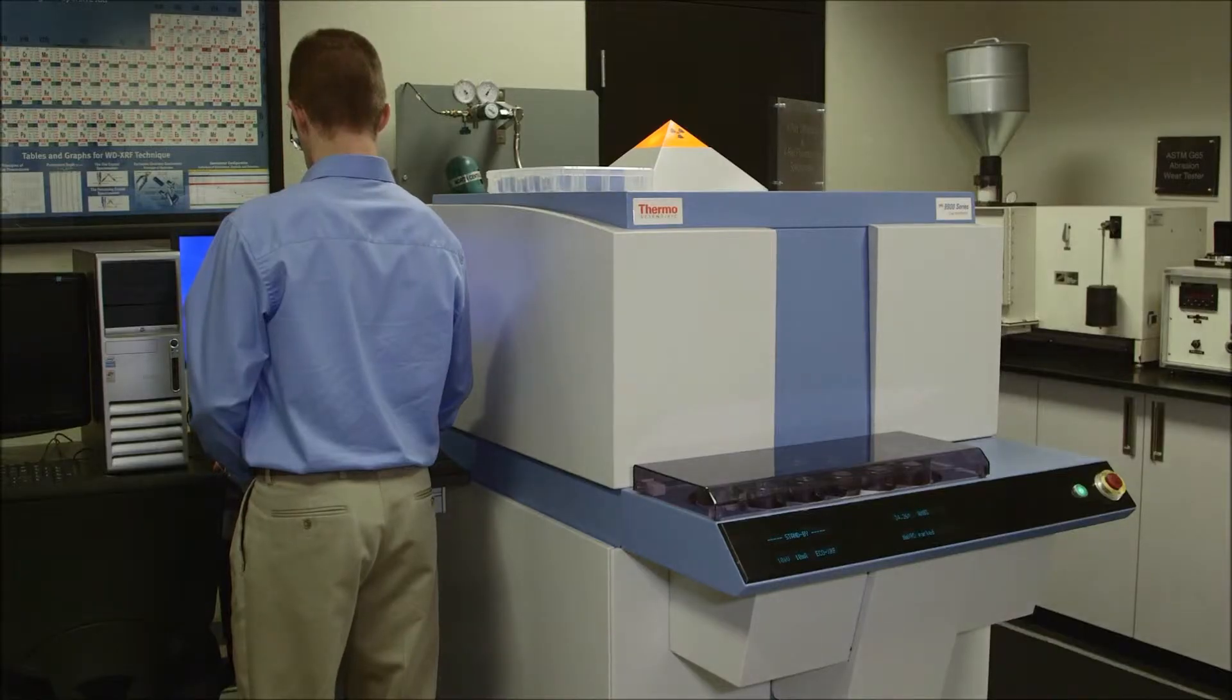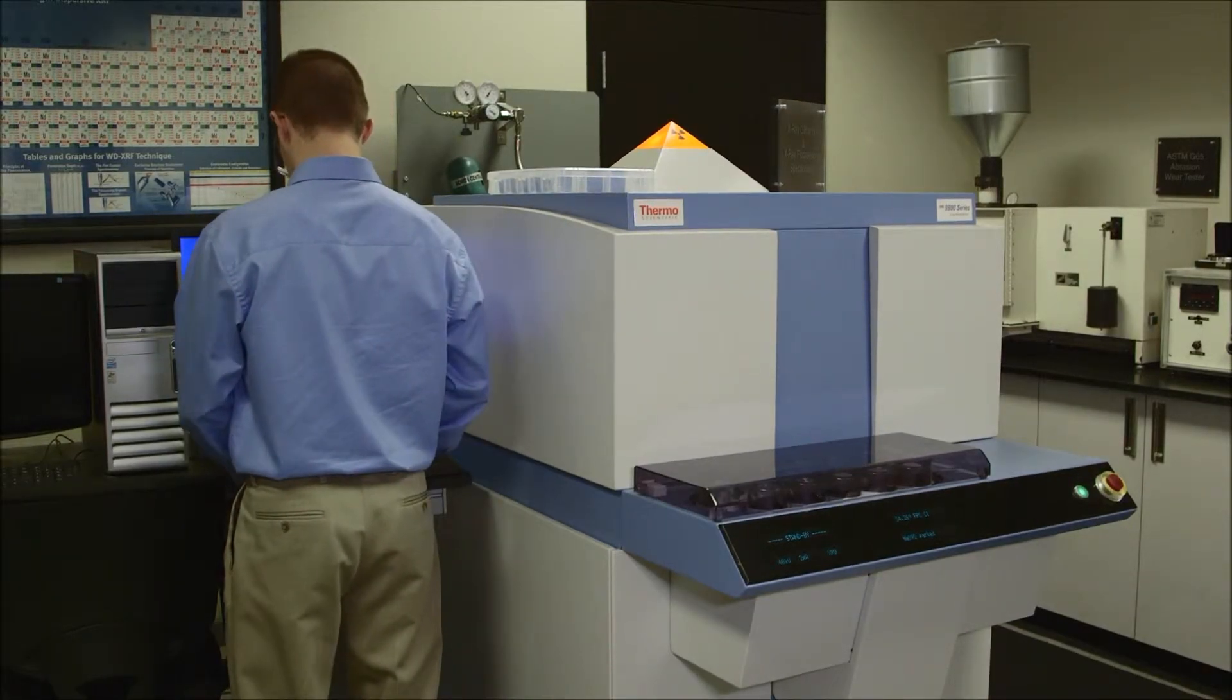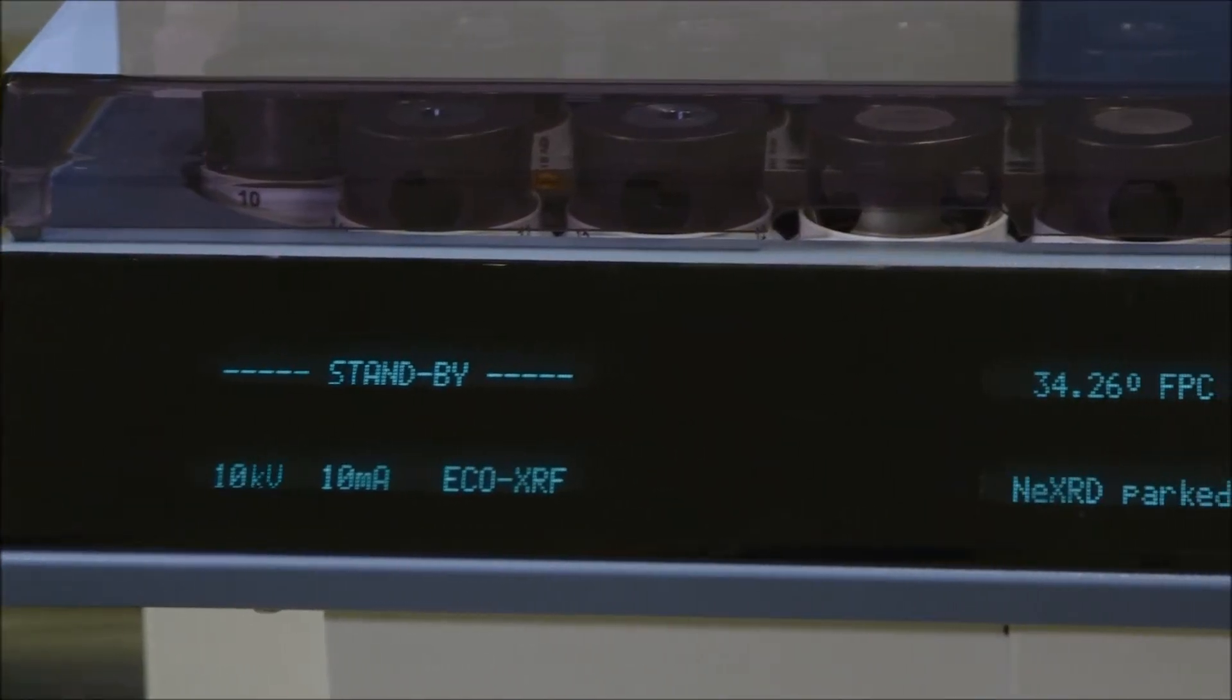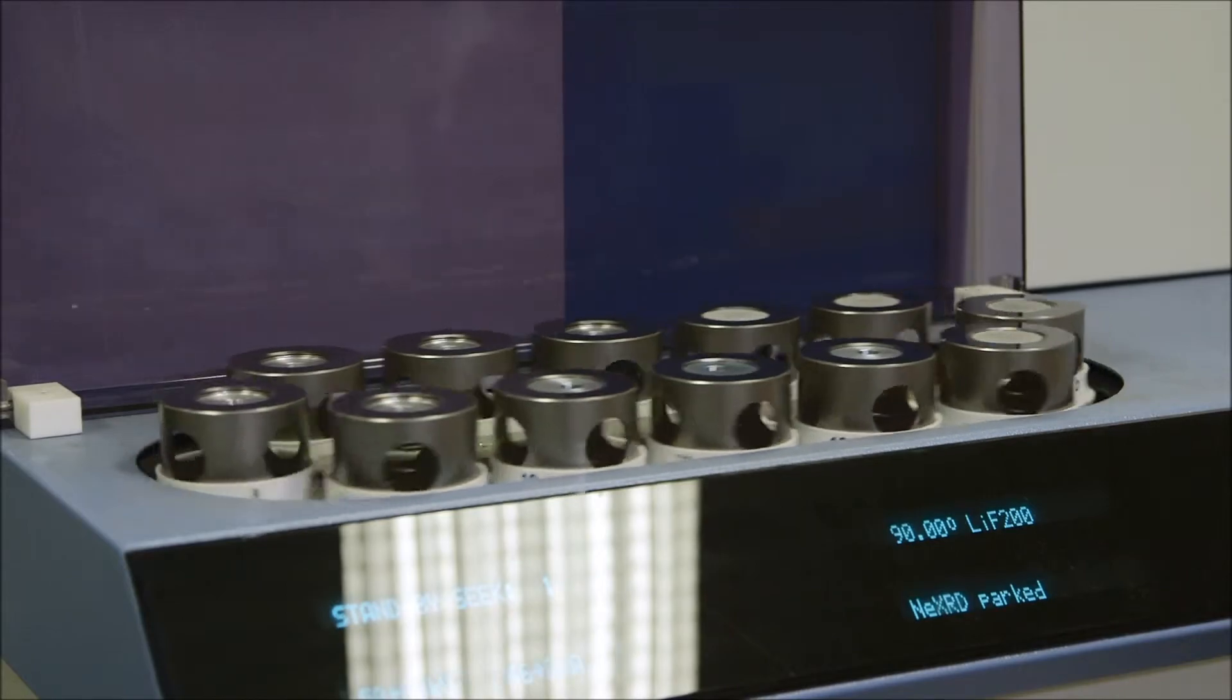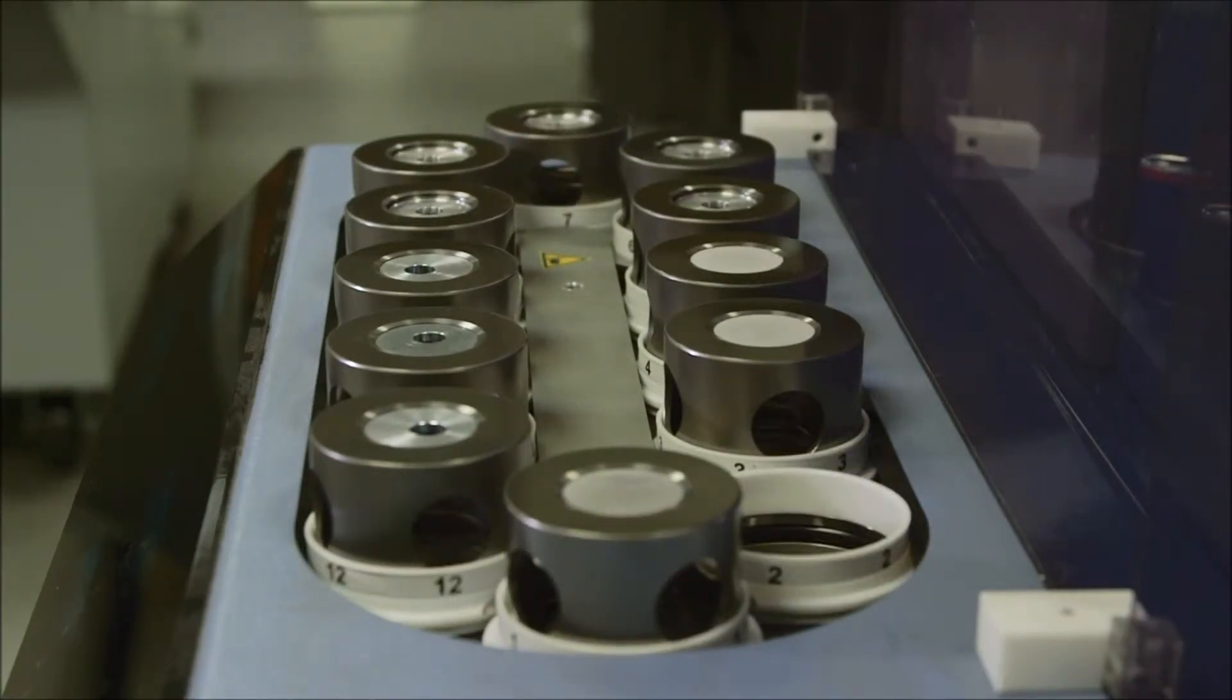X-ray fluorescence, also known as XRF, is also a very important method used to characterize the bulk chemical composition of components. We can use our thermoscientific ARL 9900 to perform this analysis, and we can perform this on steels, on carbide materials, on salts. And what we can do is we can prepare a sample that's in powder form or in solid form. We can put this into our machine and we can run XRF analysis on this, and this will tell us what elements are present within our material. And this will allow us to optimize our materials selection and processing techniques to produce components that last longer and perform better.